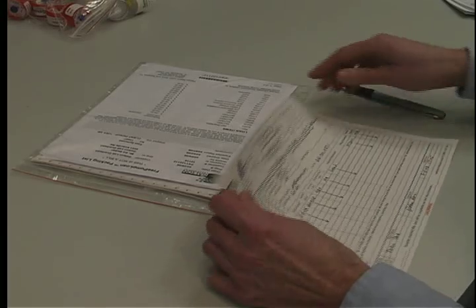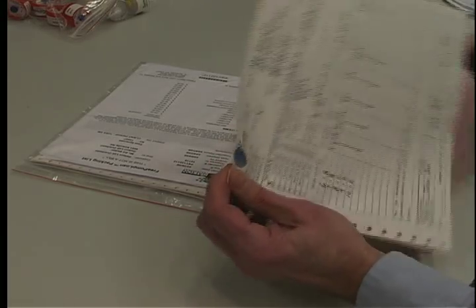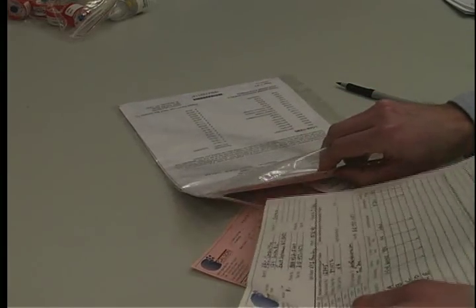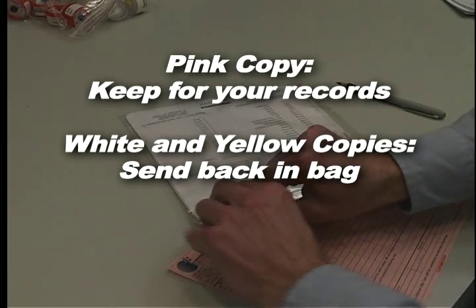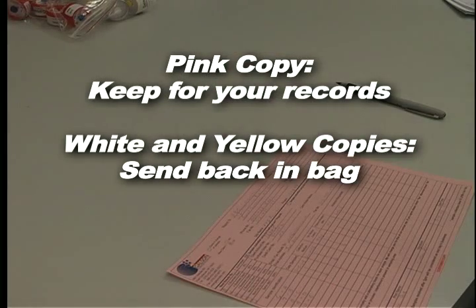Complete the chain of custody form. It is important that you include all the information requested in order to ensure the turnaround time of your samples. Remove the pink copy and keep this for your records. Send the white and yellow copies in with the samples to the lab in the large Ziploc bag.